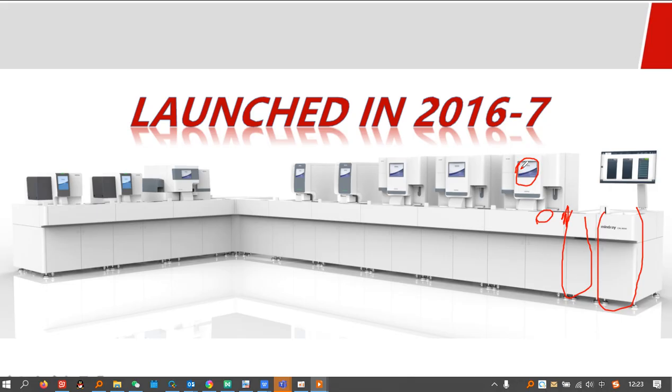So when you install the lines at the customer side, it's better to follow this order to locate the different checks and analyzers, so it can reduce many rounds of position alignment. Can you get my point? Yes, Polly. Okay.